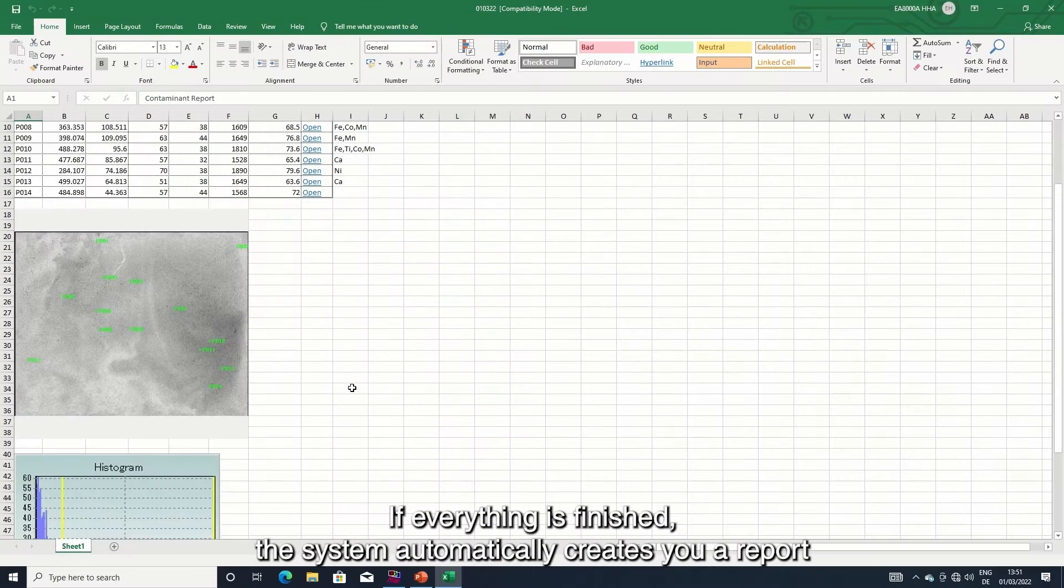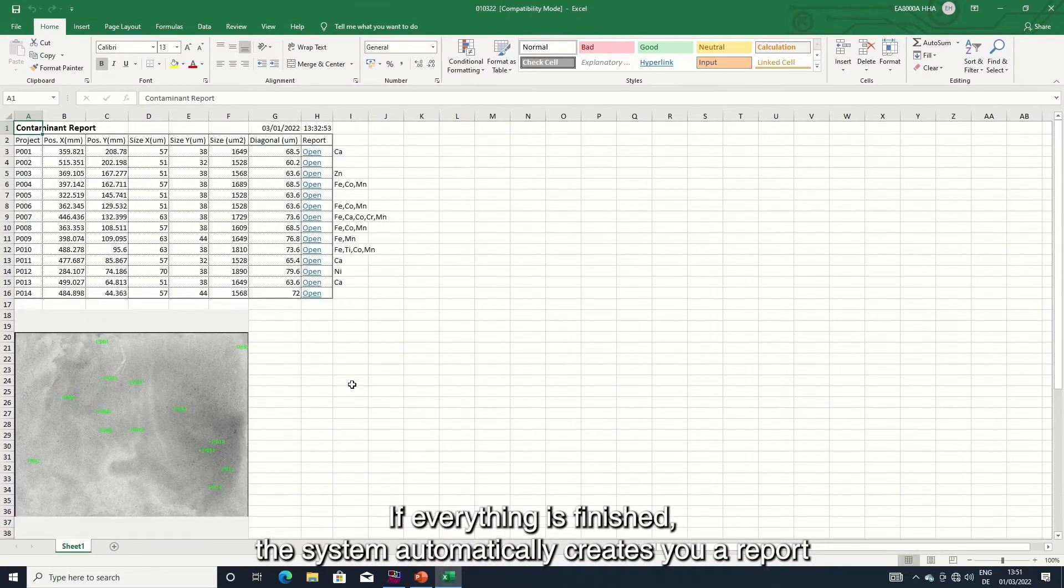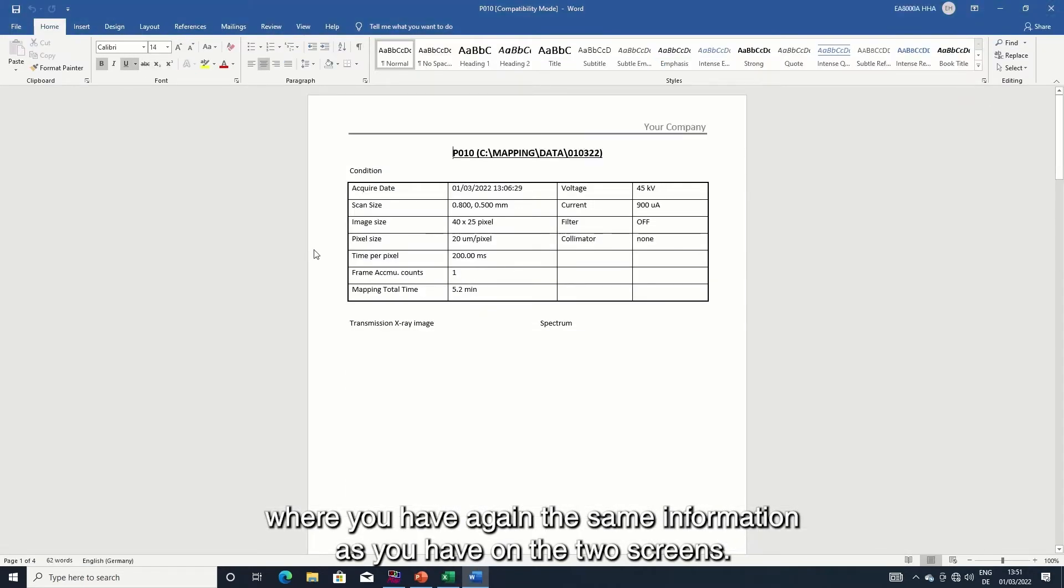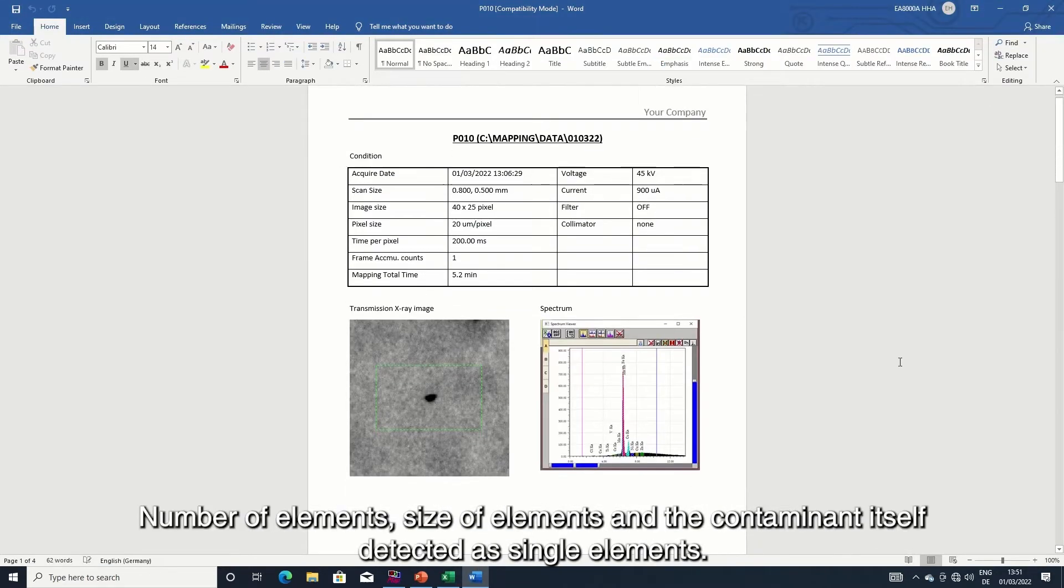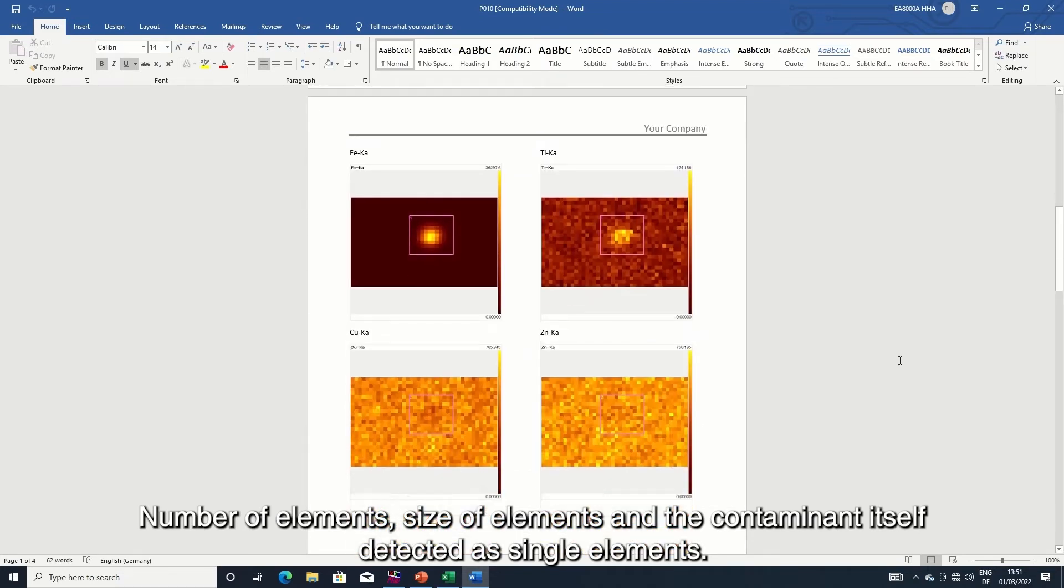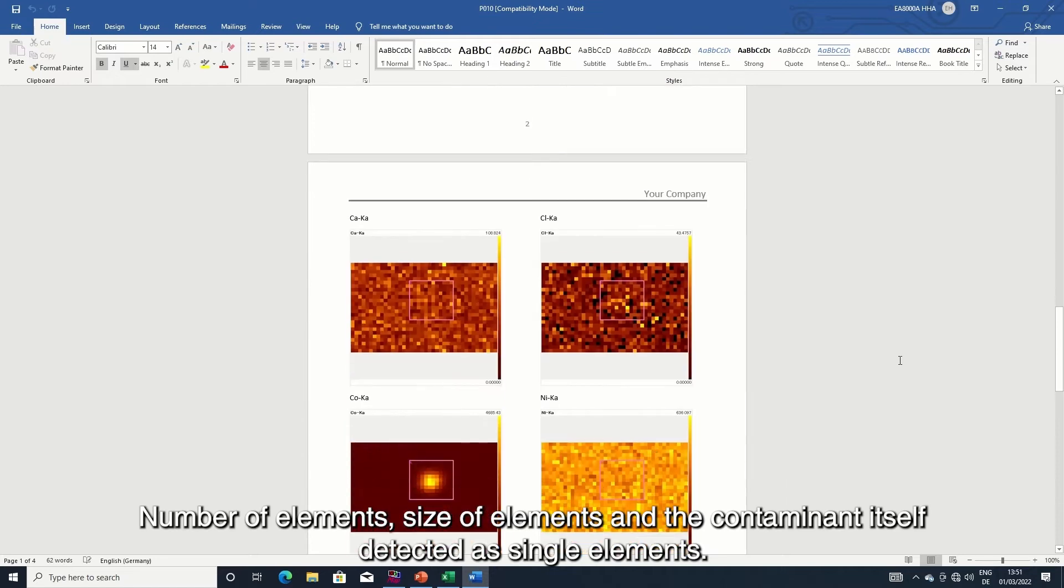If everything is finished the system automatically creates your report where you have again the same information as you have on the two screens. Number of elements, size of elements, and the contaminant itself detected as single elements.